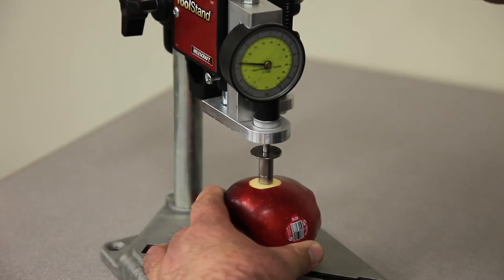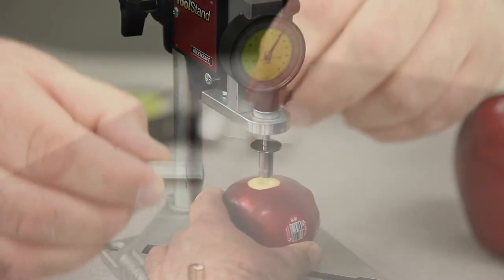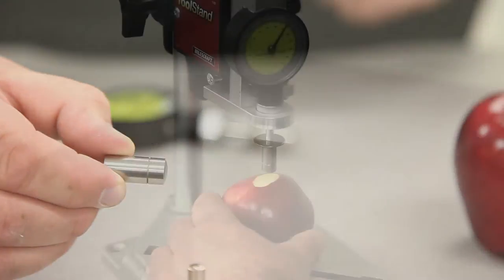Apply a slow, steady downward force to the peeled area of the flesh, making sure that you penetrate the fruit to the depth noted by the line inscribed on the tip.